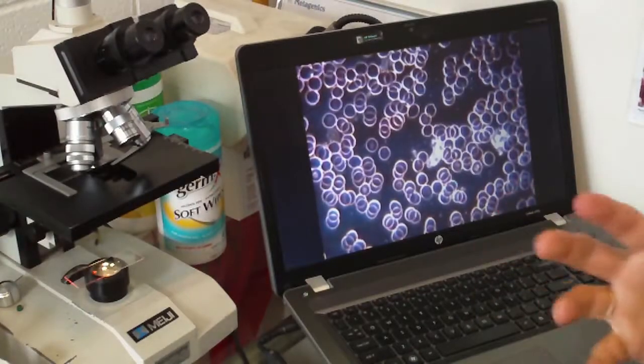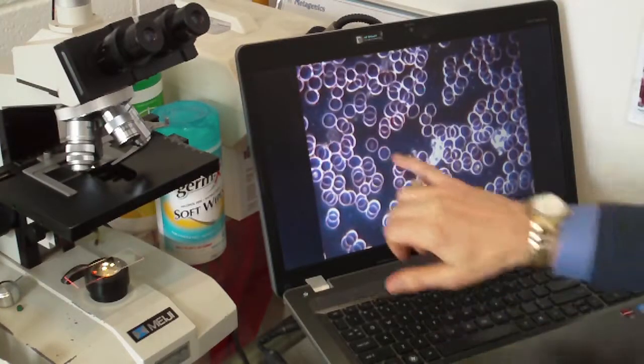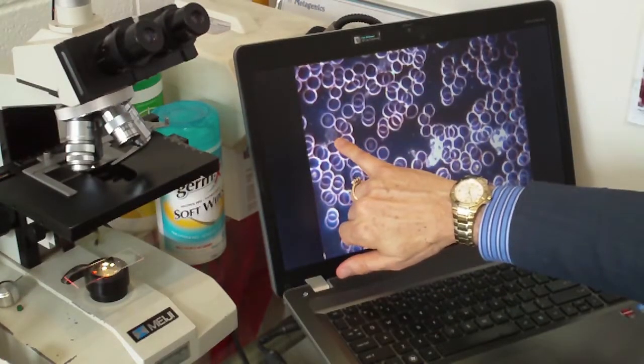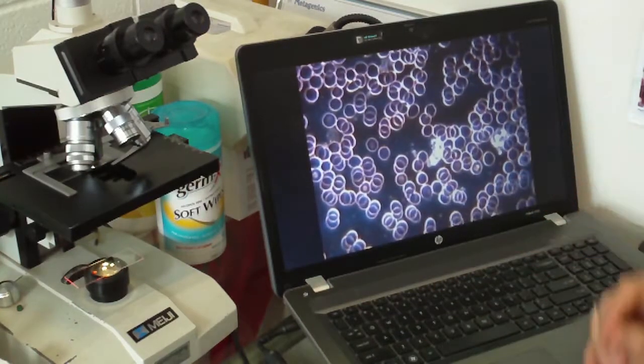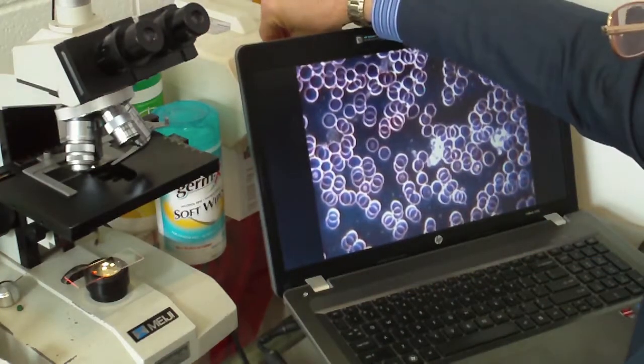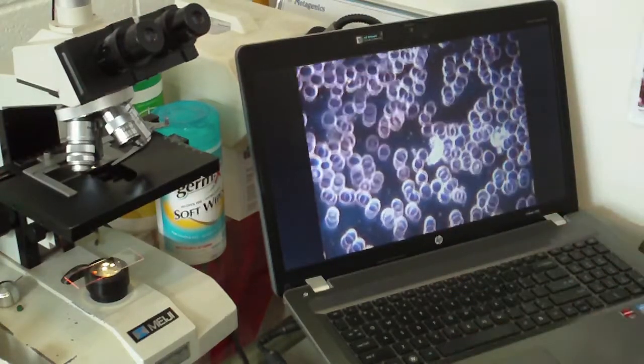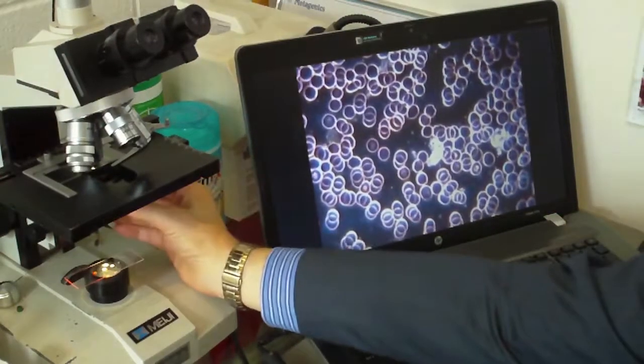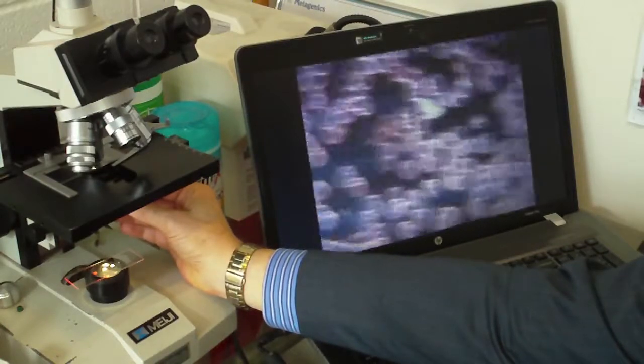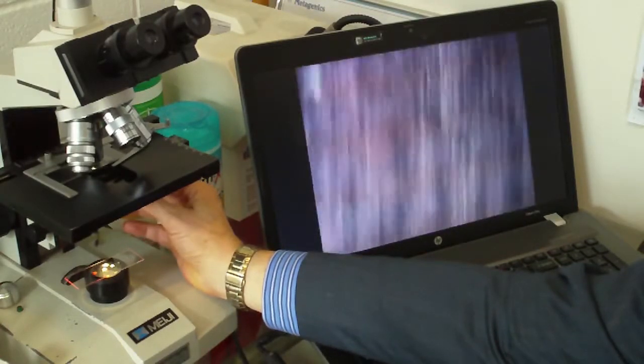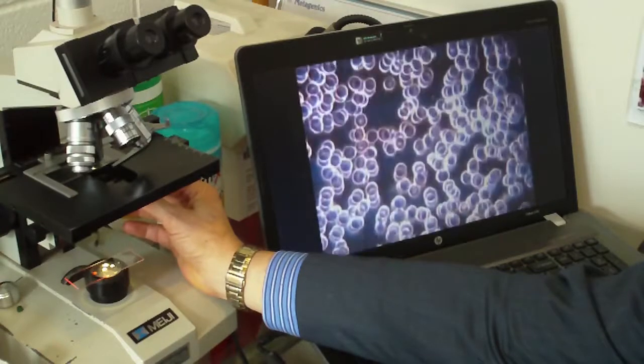If a patient had an active, aggressive virus, there would be dozens of these, even in one or two screens, and they would be pitted with white dots. And there's various other diagnostics we can use by visualizing and having a look at them very close up. So it's a great technology. It takes all the guesswork out. We can see precisely what's going on. So let's pick out something else that's more interesting here.